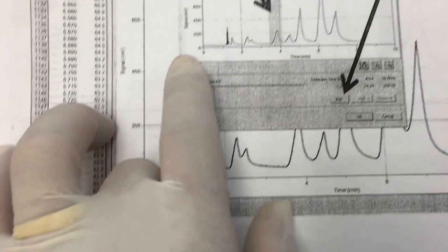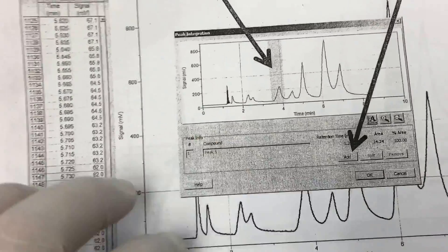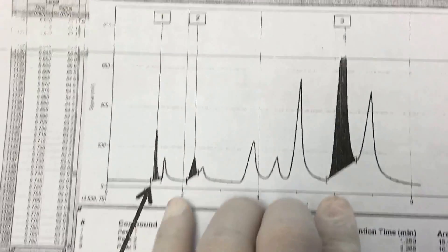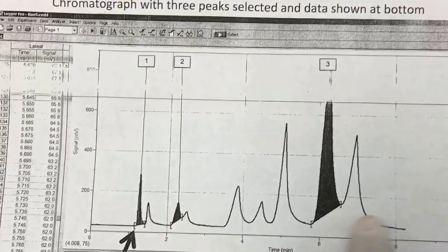Once you highlight certain portions of your compounds of interest — or multiple peaks — you can analyze and isolate them. In this case we might be interested in three peaks: the first, second, and third.